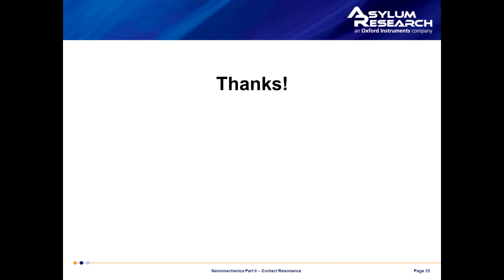All right, thank you. The next question is for Roger. What is the difference between force curve measurements and nano-indentation measurements? Thanks, Ben. That question actually comes up a fair amount. Probably the biggest difference is with cantilever-based indentation measurements, force curves. The cantilever, when it is pressed into the surface, because it's at an angle with the surface, ends up sliding a bit across the surface, and that's very difficult to quantify.